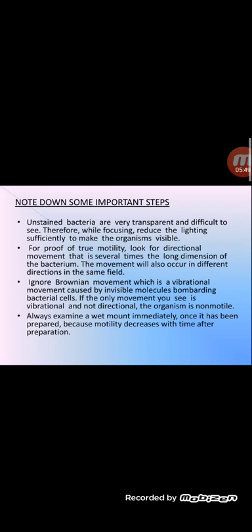Next, for true motility, look for directional movement, that is, several times the long dimension of the bacterium. The movement will also occur in different directions in the same field. Next step is to ignore the Brownian movement, which will give a false result in our observation.